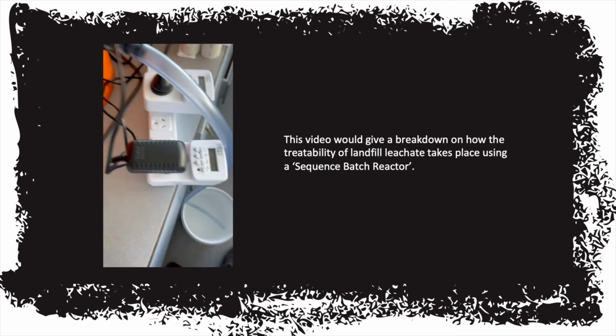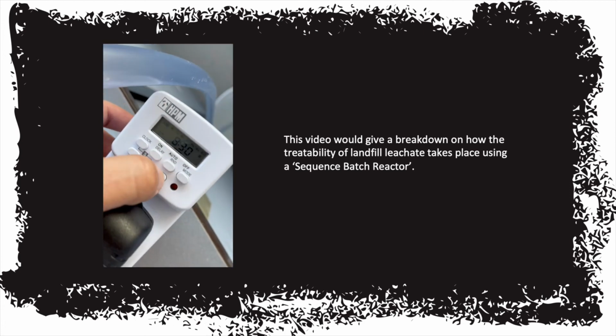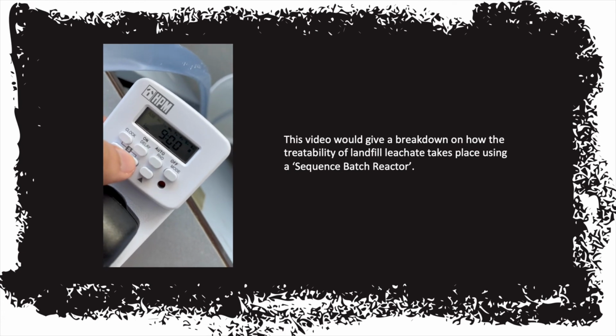Next is the solenoid valve. As you can see, it's decanted into the bucket below. It is programmed to start at 8:30 a.m. and finish at 9 a.m., which is 30 minutes of decant.